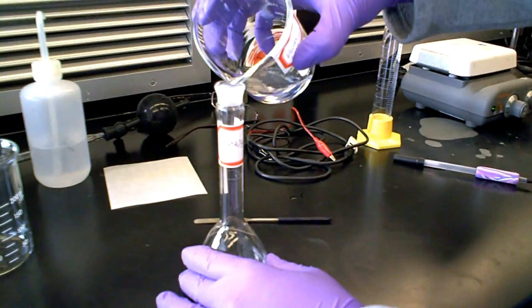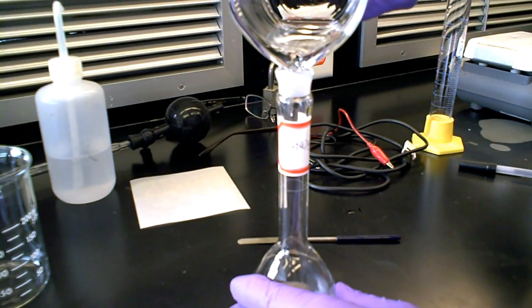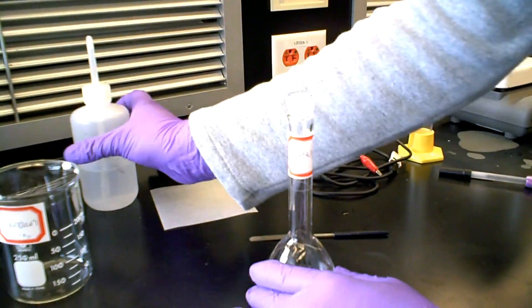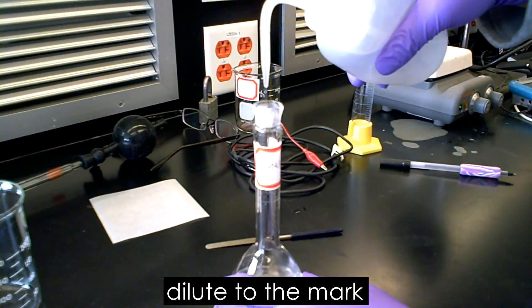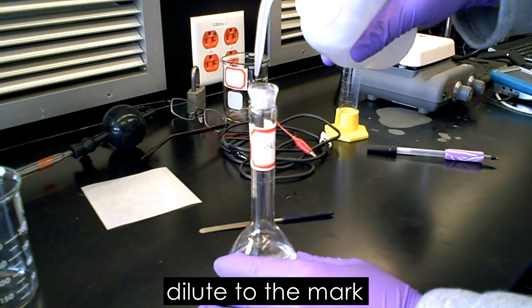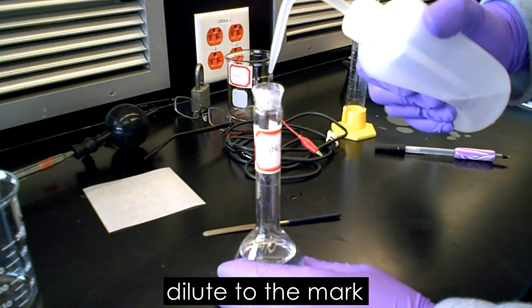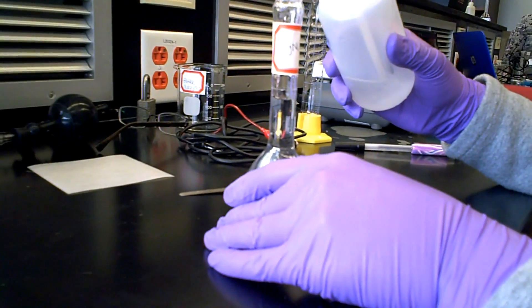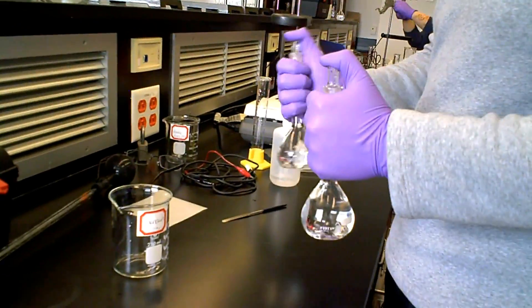Now transfer the solution into a 100 milliliter volumetric flask. Dilute to the mark with a wash bottle filled with distilled water. You will need to repeat this step for silver nitrate. Be sure to cap both volumetric flasks and shake and invert to make sure it's a homogeneous mixture.